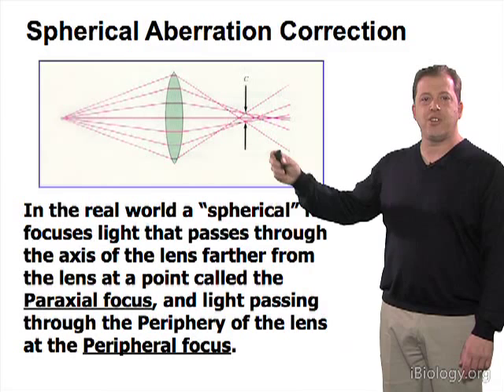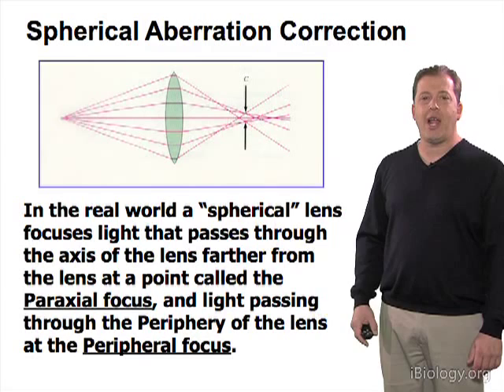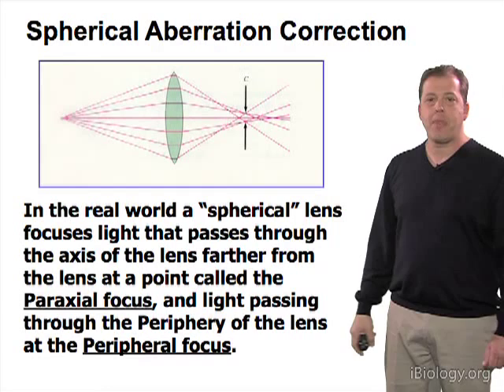Spherical aberration, as shown in this figure here, is the uneven focus of light axially — light that passes through the periphery of the lens focuses closer to the lens, while light that passes through the axis of the lens focuses further away from the lens.